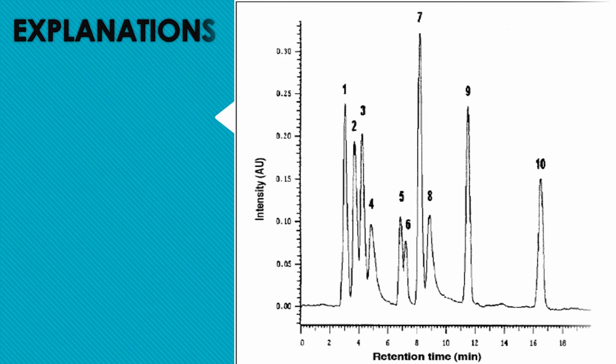Hydrophobic interaction is the main separation mechanism in reverse phase chromatography, where the more polar analytes will be eluted earlier, while the non-polar analytes are retained strongly by the stationary phase. Van der Waals forces are the main forces to occur in this mechanism.